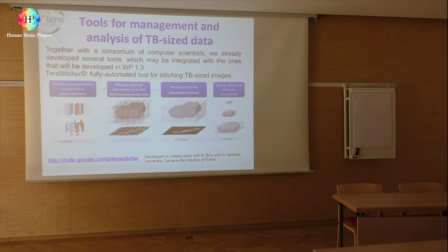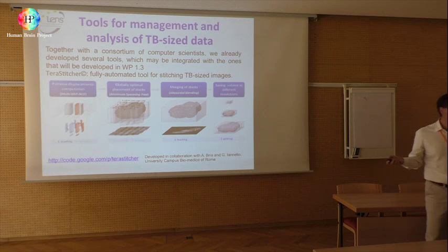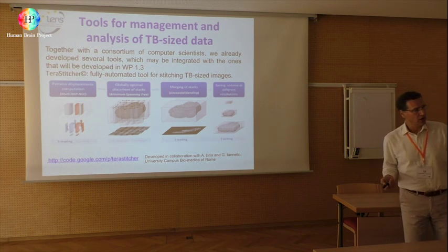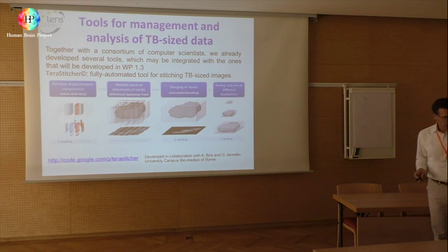And these are instruments based on machine learning, for example, because you have to stitch automatically, you cannot do it manually. There are 10 terabytes of data. If you think about the human brain, it's 10 petabytes of data. It's impossible to do manually, and it requires petaflops of power.